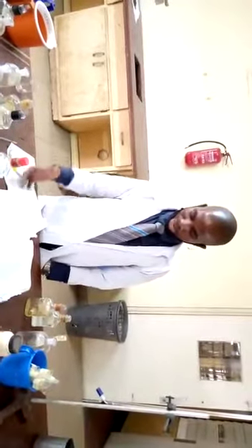Going to our fundamental tests for proteins and amino acids. Number one, our fundamental test we're going to consider is the ninhydrin test. This usually is positive for most amino acids. It is positive for primary amines, primary amino acids, and even ammonia, which is not a protein and not an amino acid, but is similar to amines because hydrogen is attached to nitrogen.